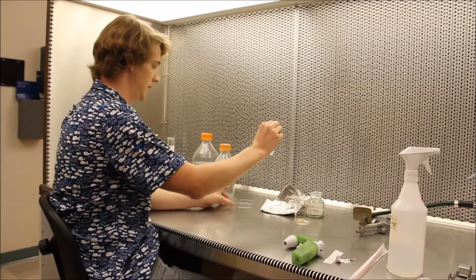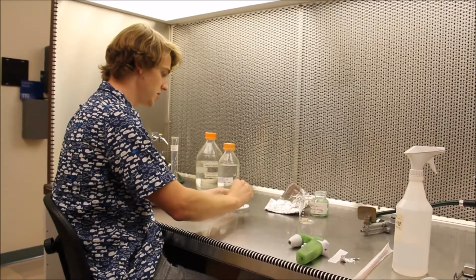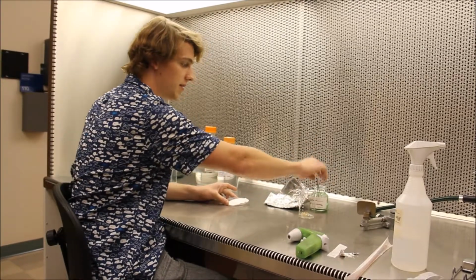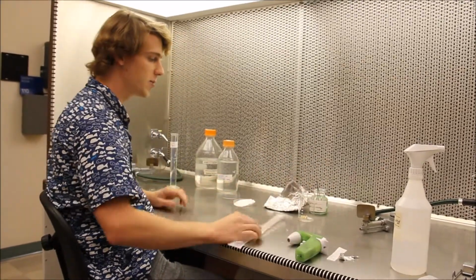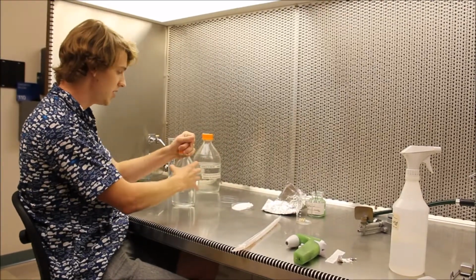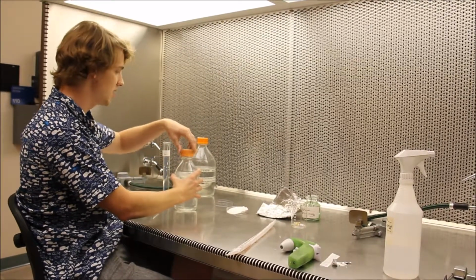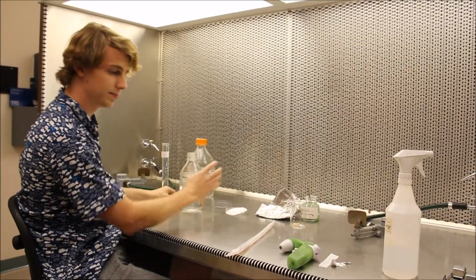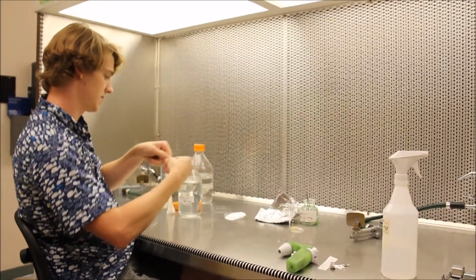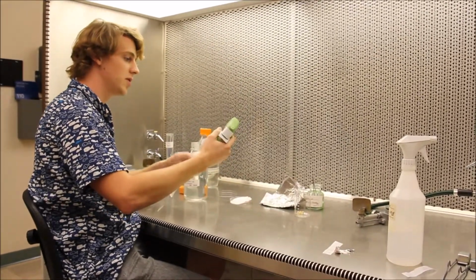You grab your filter paper and you slowly put it into your petri dish. Then you will want to wet your filter paper with germination and co-cultivation medium, which is basically 1/2 MS with some various vitamins and a little bit of sucrose and no gelling agent. Use 4 milliliters.